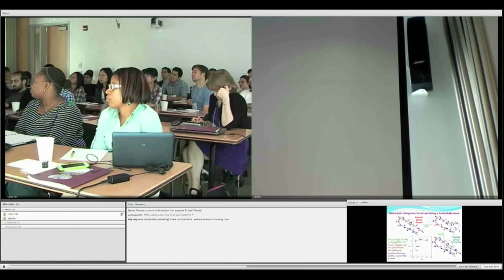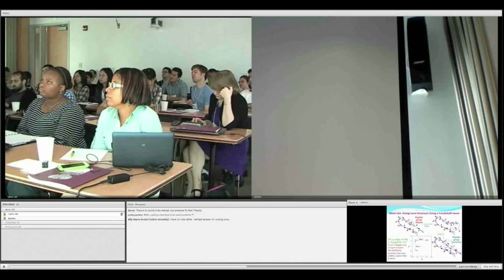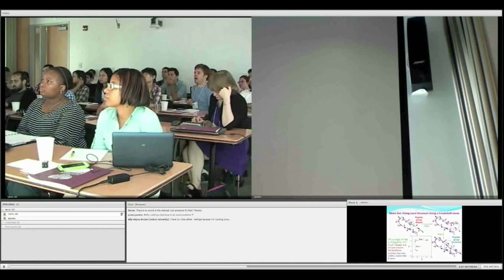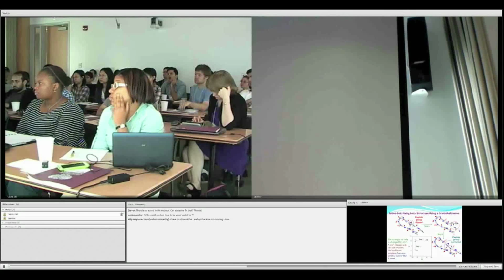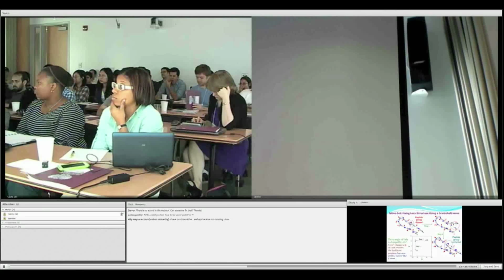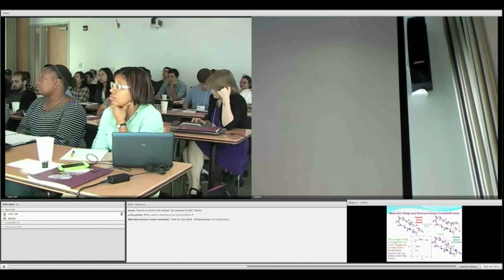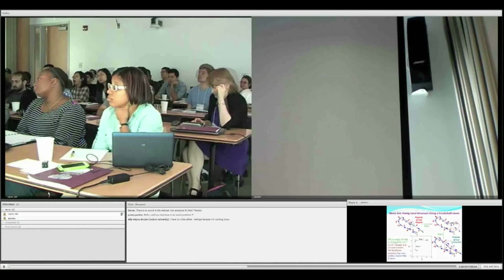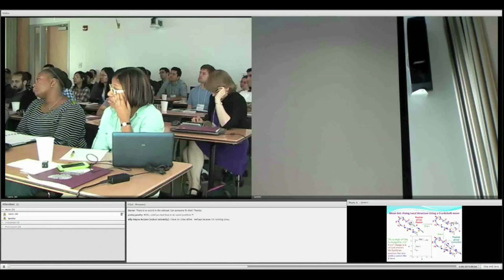So how do we do this? This is the idea. Let's say I would like to bring this Valine 5 to this region. So I would change its psi angle by minus 170 degrees. So this would be here. I have a peptide group that is flipped, and I want to correct this, so I will bring this in by minus 170 degrees. You can see the distortion here. So the chain goes out on the other side.